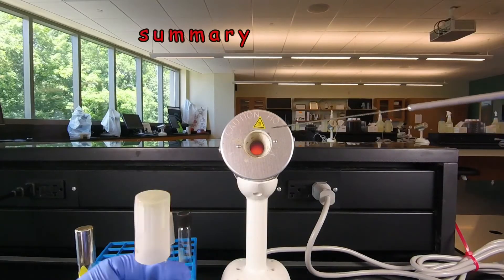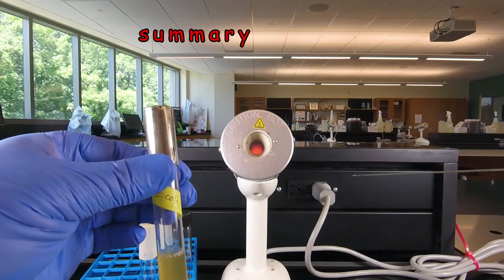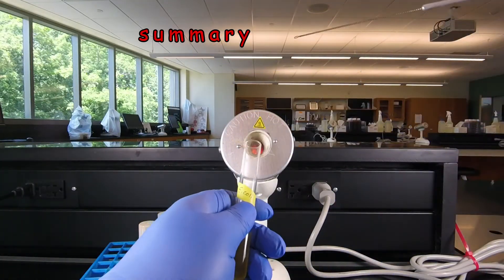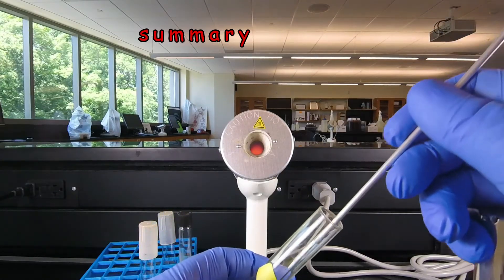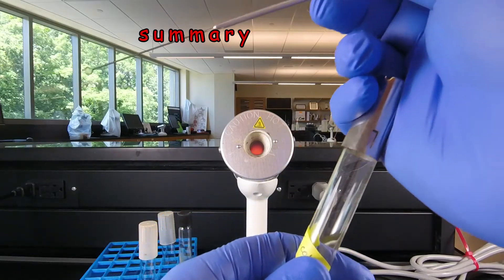So when we're ready to remove bacteria from a pure culture like this E. coli, we would remove the cap with the little finger, flame the tube, take out the bacteria with our sterile loop, flame the tube and put the cap back on.